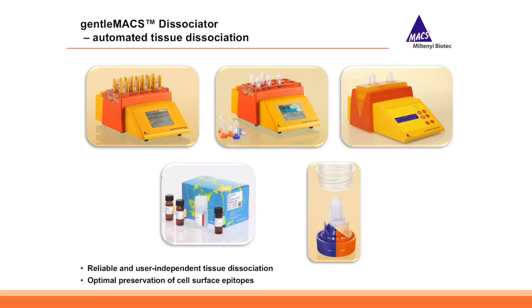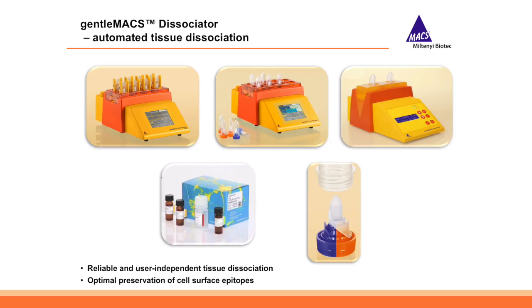Using the GentleMACS dissociator or the GentleMACS Octo dissociator, the tumor dissociation was automated and optimized for epitope preservation.